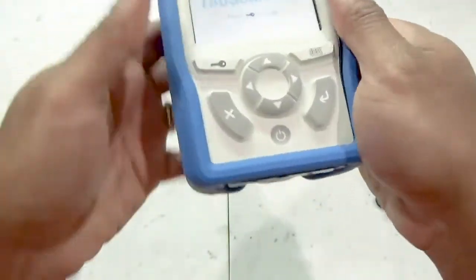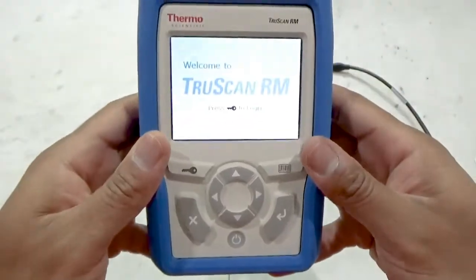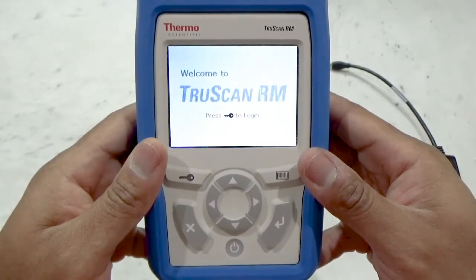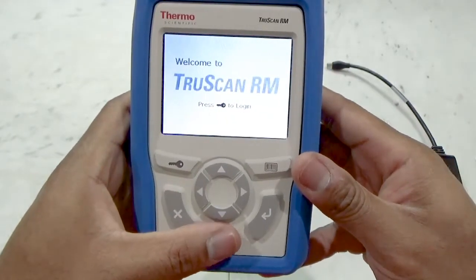On the face of the instrument is our impact and shadow-resistant color screen and several function buttons. The power button to turn the instrument on, off, or put to sleep.